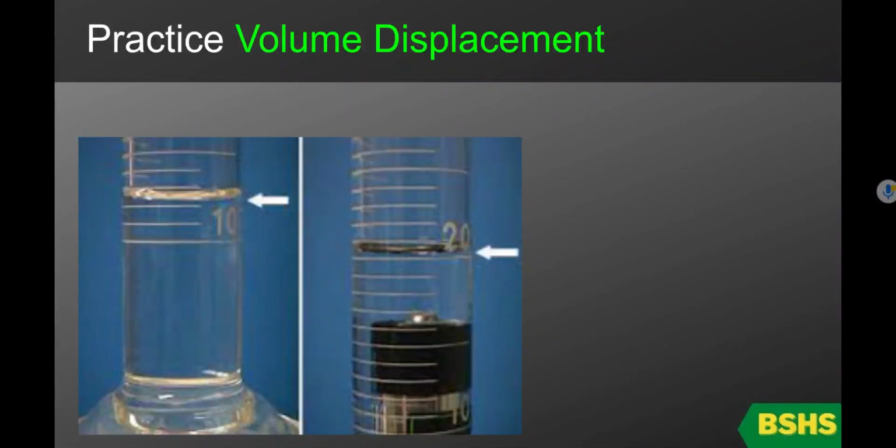Now it's your turn to practice volume displacement. The image on the left shows your initial volume. The image on the right shows your final volume. Pause the video and do the calculation to determine the volume of that black cube.